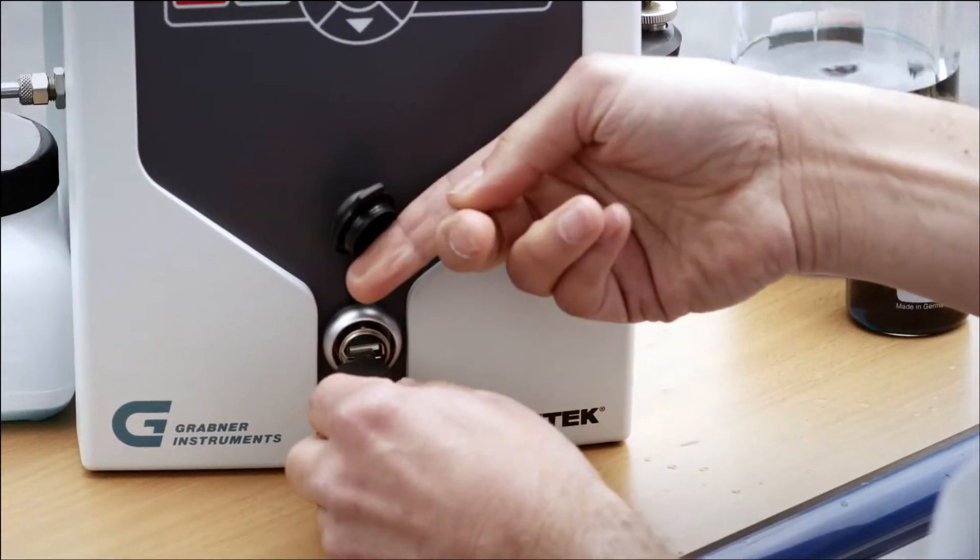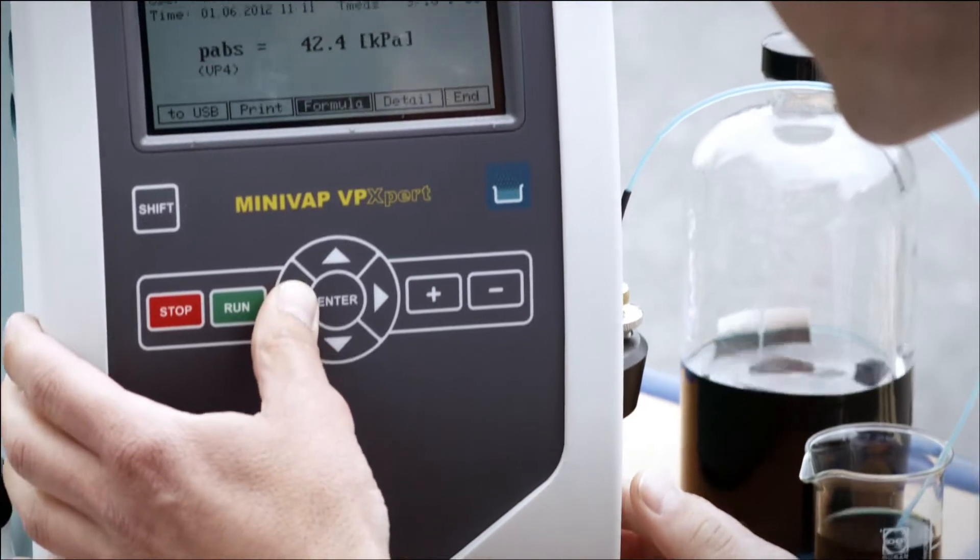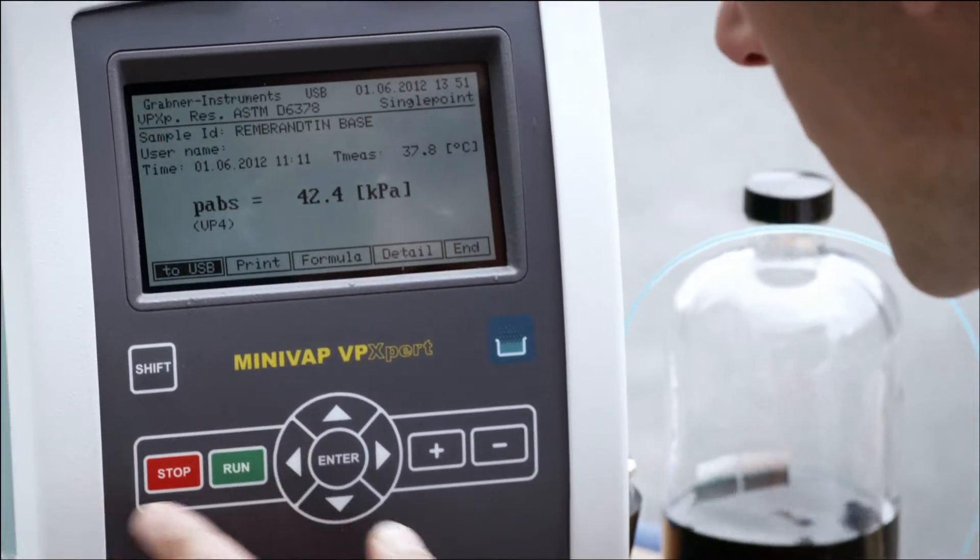And results handling is so easy. I can download results quickly to USB or transfer data to my LIMS.